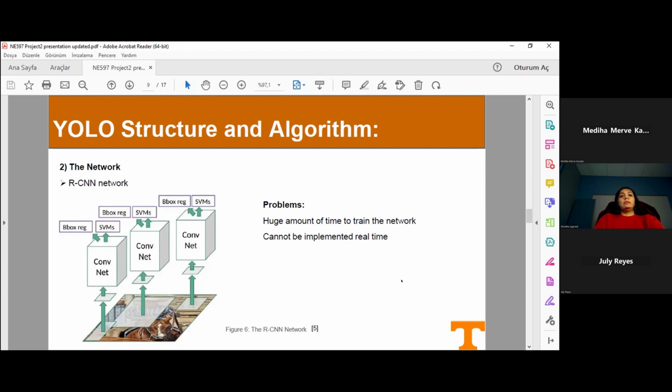So why are layers used in CNN? This enables the CNN to convert a 3-dimensional input volume into an output volume. Convolution, pooling, normalizing, and fully connected layers make up the hidden layers. Multiple convolutional layers are used in CNN to filter input volumes to higher levels of abstraction.